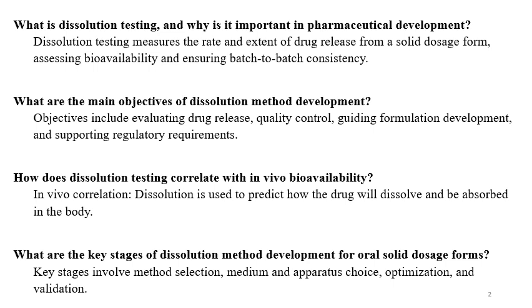What are the main objectives of dissolution method development? Objectives are evaluating the drug release, quality control, guiding formulation development, and supporting regulatory requirements of different countries.